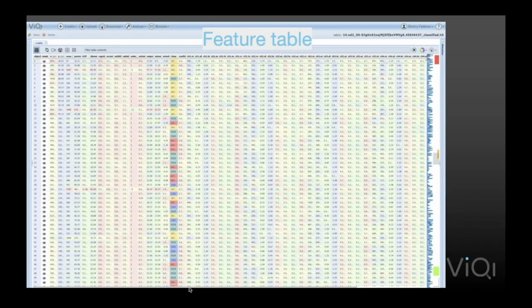And of course, the cell has a representation that we saw in the previous images in the different fluorescence channels. So there's descriptors of the bright field channel and separately descriptors in all the other channels that you have for the same cell. And they could be the same descriptor, they just apply to the other channels.